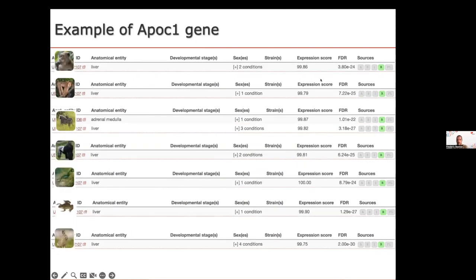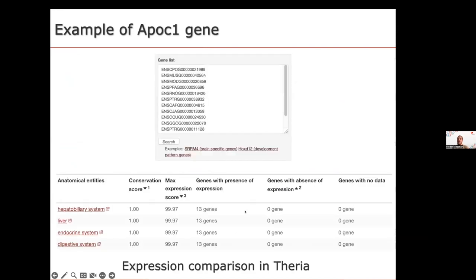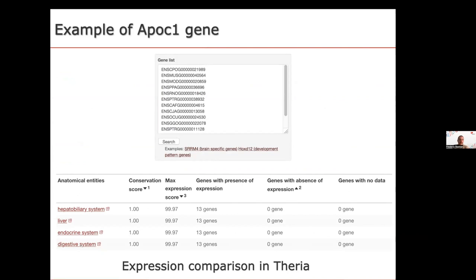We also have a tool where you can automatically compare expression between a list of genes. Here, entering the orthologous genes of Apocan in our tool, the organs identified as most highly conserved in their expression are the hepatobiliary system and liver — all orthologous genes have significant expression in this tissue. You can perform this analysis automatically without going through each gene page individually.